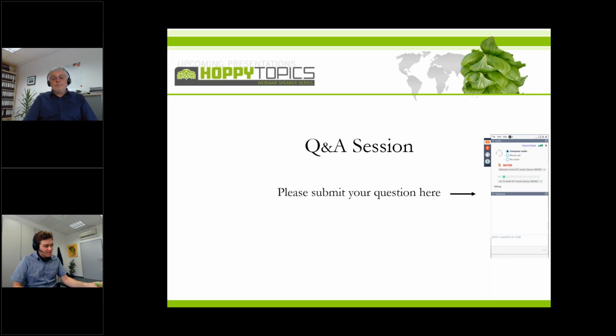In the end, you mentioned in the slides the increase of myrcene, linalool, geraniol, and 2-methylbutyl isobutanoate when using 300 grams per hectoliter, and then you compared it also with 500 grams, and you mentioned the more hops you add, the more of those relevant components you get into the beer.